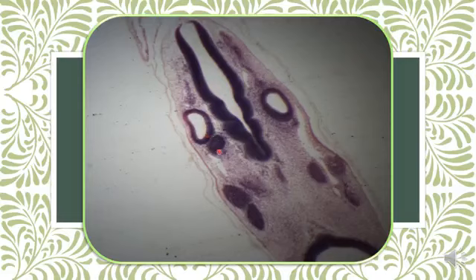More anteriorly, this is called the trigeminal ganglia or semilunar ganglia, while caudal to the ear vesicles, this is the 9th and 10th cranial nerve. This is the cardinal vein.